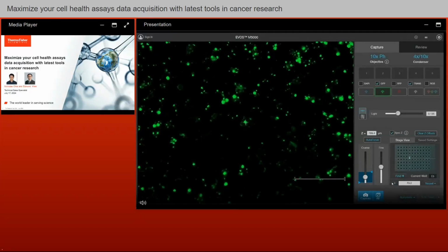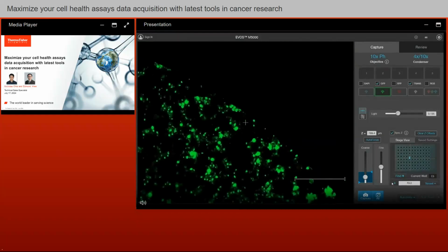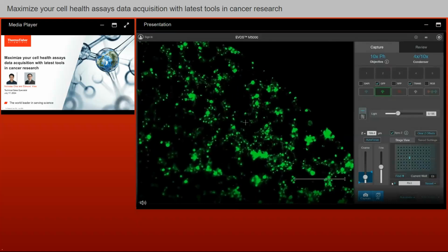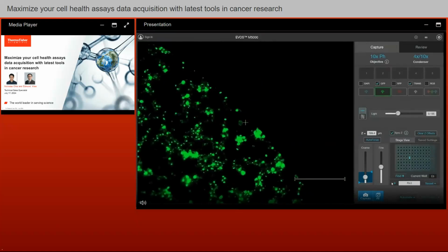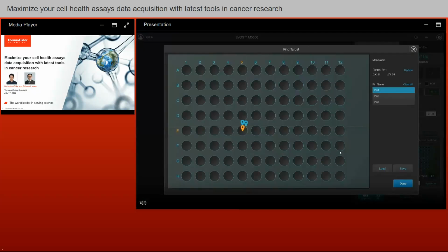And now probably a third one that's at the corner of the well. Let's try to find one. I see something interesting here. So probably let's choose this cell. It's going to be easier to identify, and add a third pin here. So now look at the find map button. You can see that we have added 3 pins into the list.